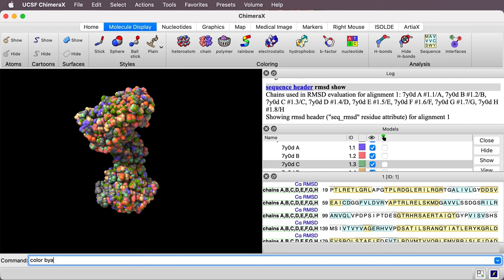I'll say color by attribute. I give the attribute name which is c_alpha_RMSD. So from the sequence viewer the RMSD that was calculated. I want to color all eight models. I can refer to those as number one since they're number 1.1, 1.2, 1.3. And then I'm going to give it a color palette. The lowest RMSD I'm going to say blue, colon yellow, colon red.